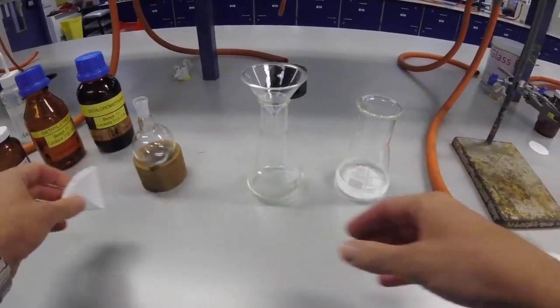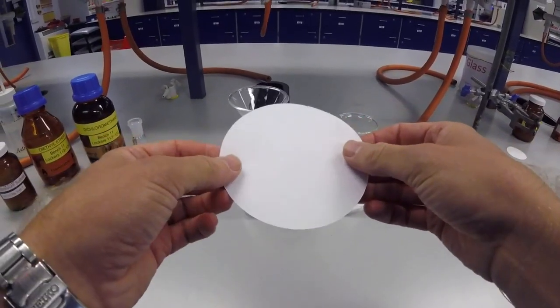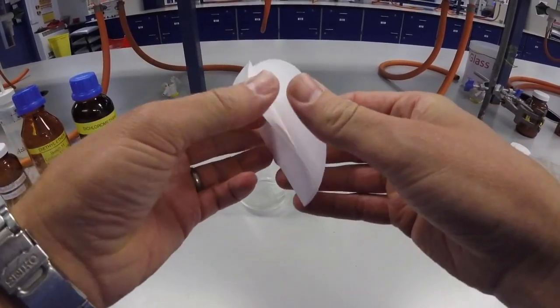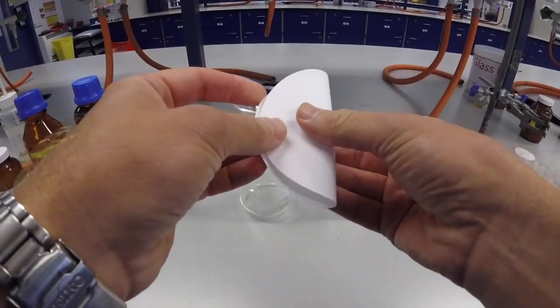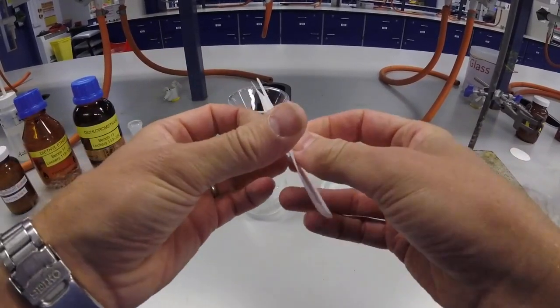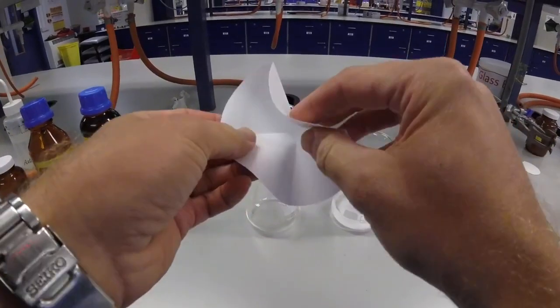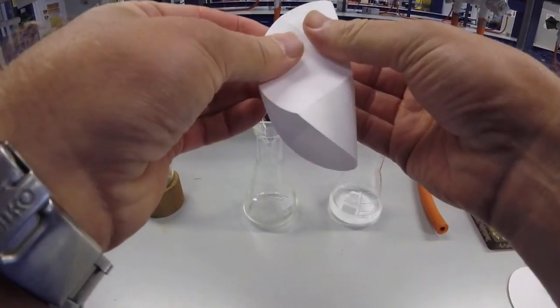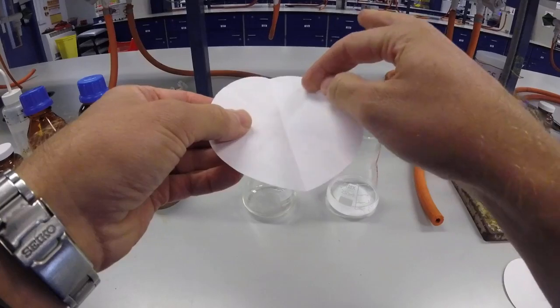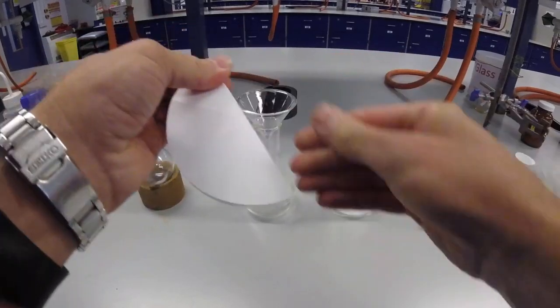which is where you need to learn how to flute a filter paper. So fluting a filter paper is actually quite easy. Take your filter paper and fold it in half, open it out and fold it in half again, matching up those folds. So you now have an X all going into the centre. And then you're going to take that and fold each one of those in half again. So now we fold it over that way, and we've bisected that part, and then we fold it over again. And these folds are all in the same direction.